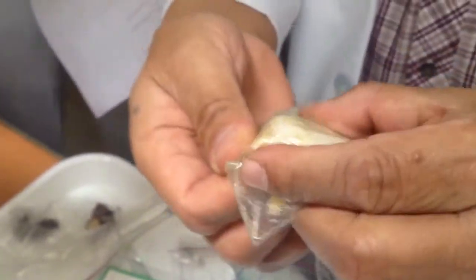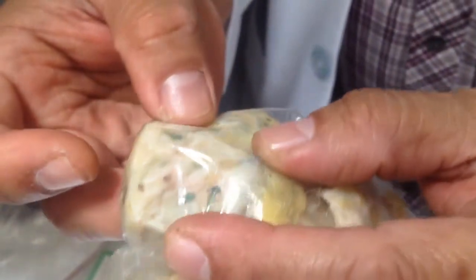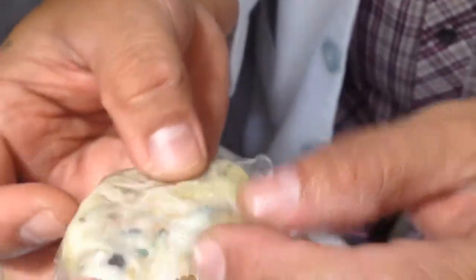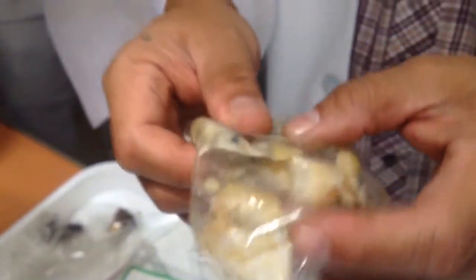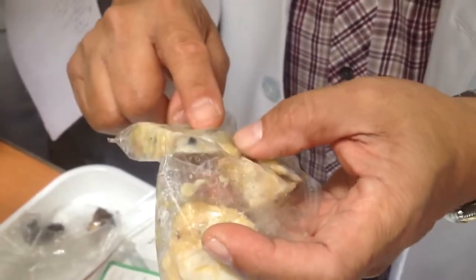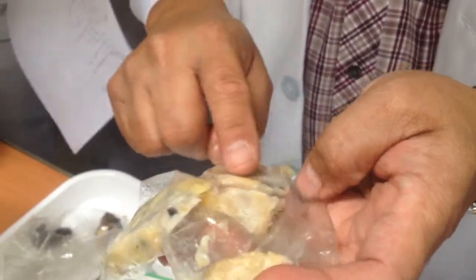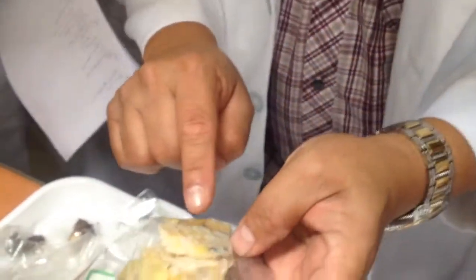That is a cavity. And those green things are cavities. This one is a cavity. So that is the main lesion in your cystic disease. Notice also that the tumor is alternating with adipose tissue. It is not a well circumscribed lesion. Those are cavities. You see that now? Cavities.